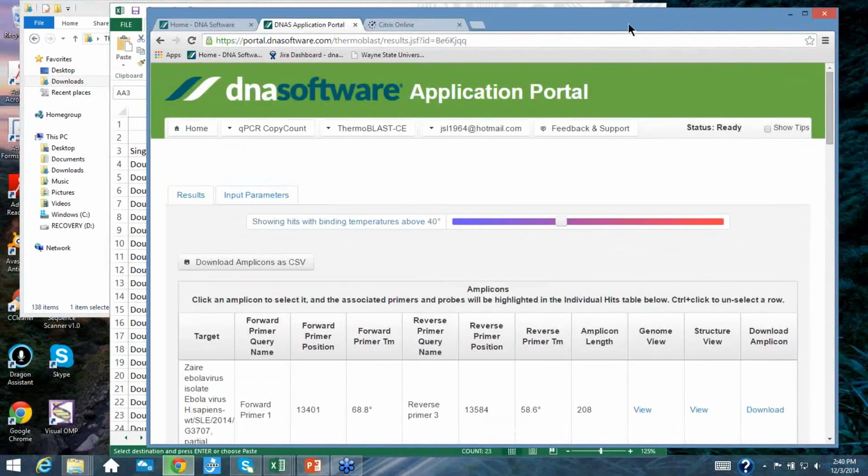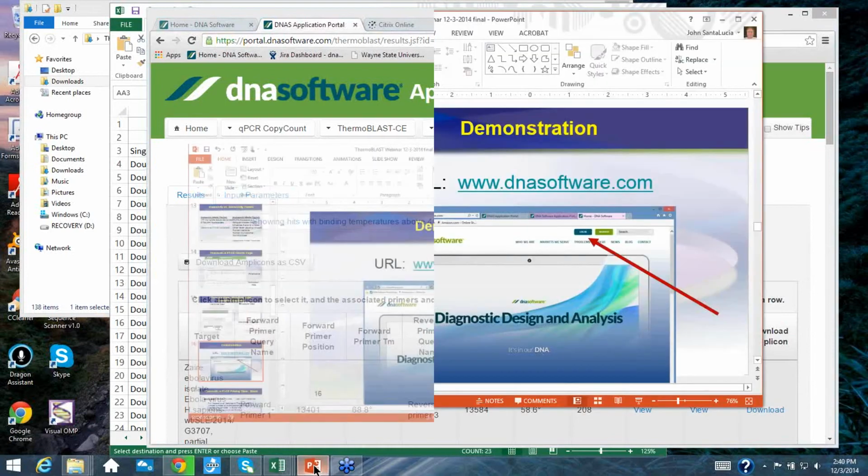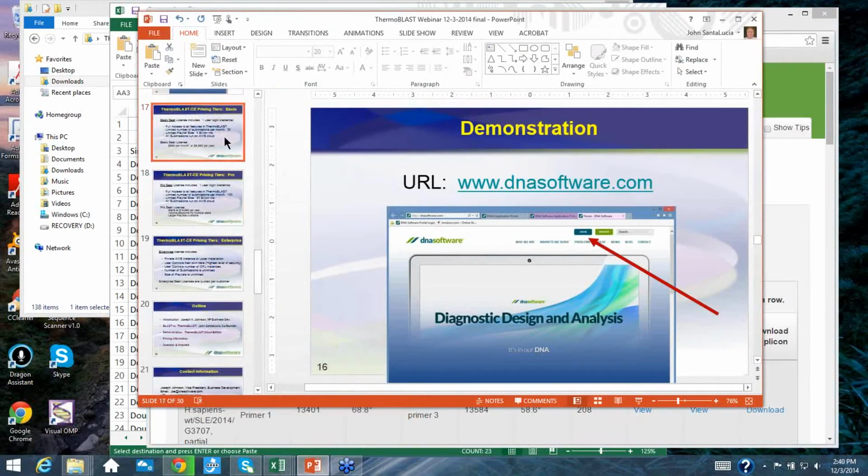All right, I think with that, I've pretty much gone through all the features of ThermoBLAST. And at this time, I'm going to turn it over to Joe to talk about pricing, and then we'll take questions from the audience. All right, Joe.